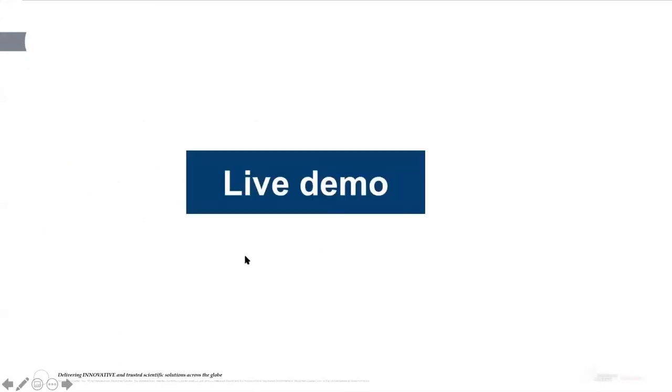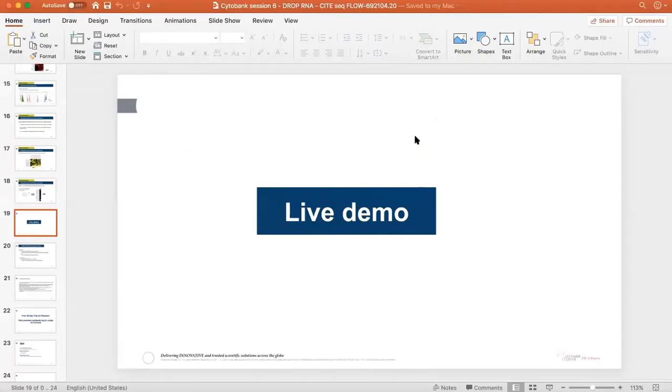Now I will do a live demo to show you how you can actually import the data into Cytobank. So let me share my screen.